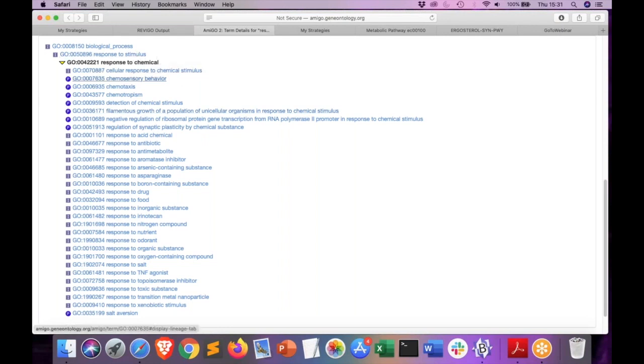Essentially all of these GO terms are granular components under larger components that define them as a response to stimulus. So when we talk about running GO enrichment using GOSlim, you're essentially using the cut down or slimmed version of GO ontologies, containing only a subset of the terms describing all of the subfamilies that are included in the response to stimulus family.